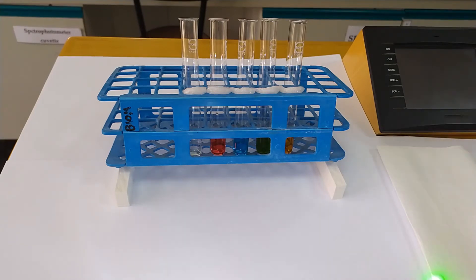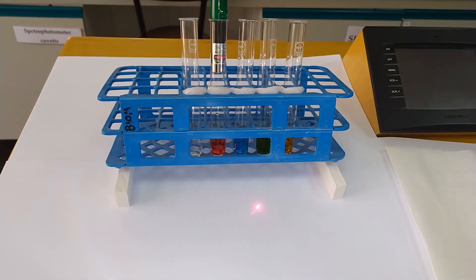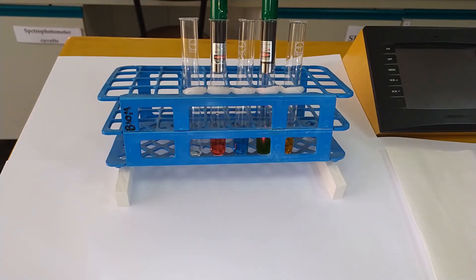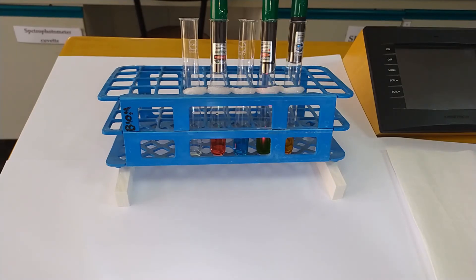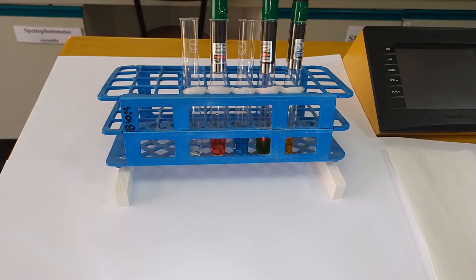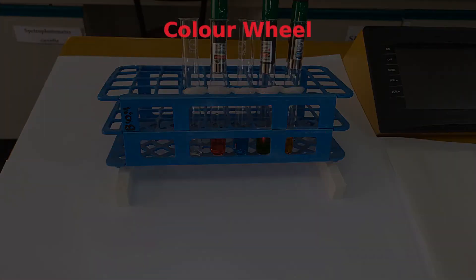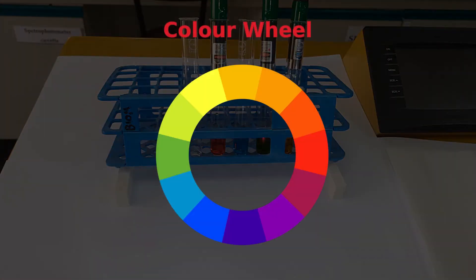For example, when I put the green light into the red solution, all the green light is being absorbed by the sample. I do the same thing with the red light into the green solution. Once again, all of the light is being absorbed by the sample. And lastly, the blue light into the orange solution, and once again, it is completely blocked. It just seems a lot like the pattern is related to the location of the color on the color wheel. The colors that are on the opposite sides of the color wheel seem to absorb each other.